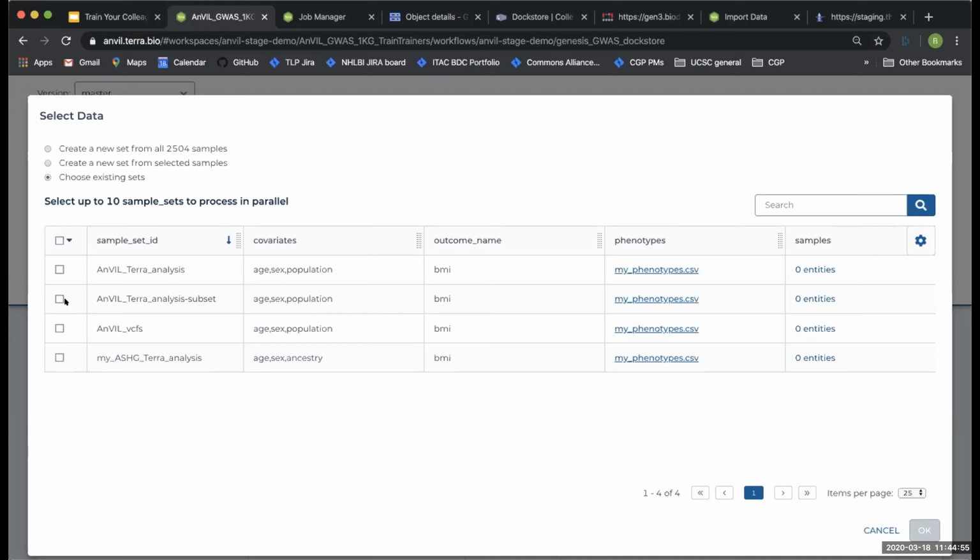That's different from a workflow that expects a single file, for example. You provide a set of entities so that each row is going to spawn a separate workflow, and the workflow is going to take in a single file from that list. And you can use sample sets or whatever sets of whatever you want in both ways. It really depends what the workflow expects.